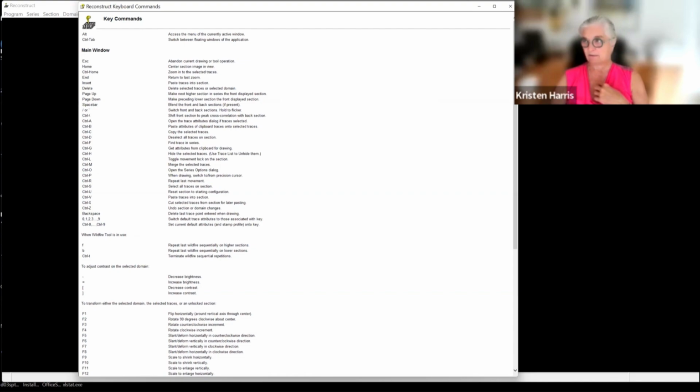I also think C3 Deep, according to Mark, does that already too. So these are the things that we might want to think about reaching out to Mark Ellisman about, in C3 Deep. And then obviously there's the contrast adjustment for the brightness, and these values actually get stored with the domain image as it gets changed.